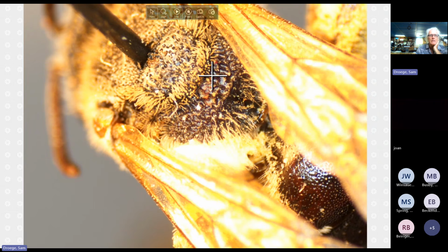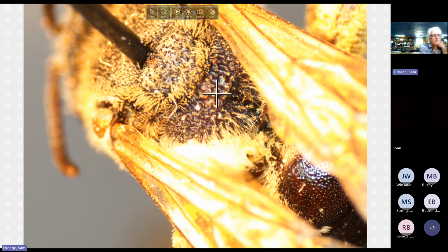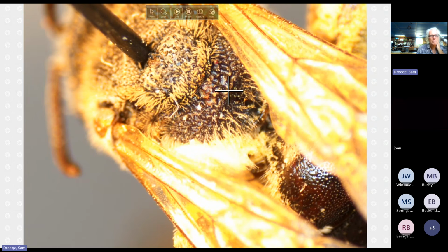There's none of what you see in other ones where you see within the propodial triangle area what amounts to a series of long rectangles, where the longitudinal raised carina striations are forming big cells, but here it's basically a net. So in other words, there's no particular direction to the dimensionality of the different veins, if you want them, or carinae. And it just is like a netted structure.